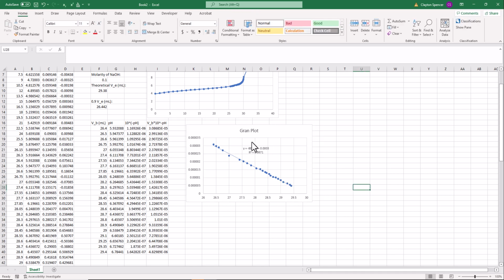Now we're probably going to want to know the slope and the intercept and have them entered in cells here with a few more significant figures. But notice our r squared value, we've got 2 9s here, so that's reasonably decent. There are a few little points that wiggle off the line, but it doesn't look like the line is deviating.